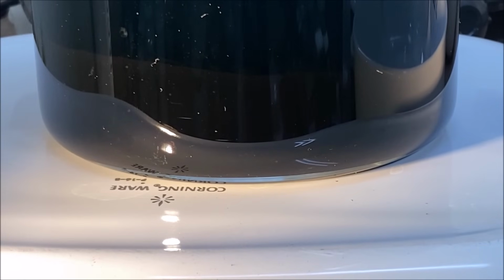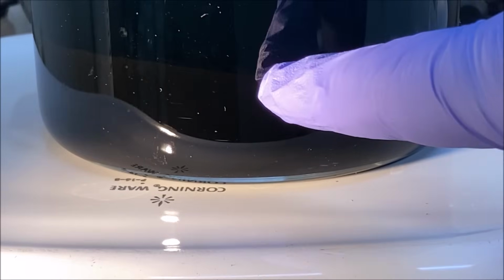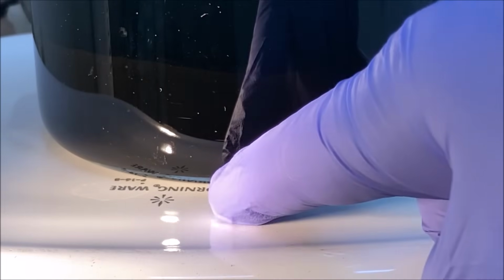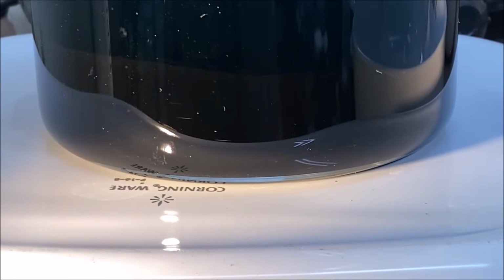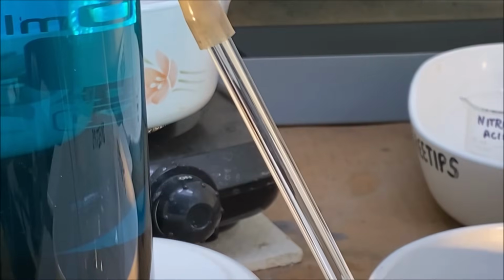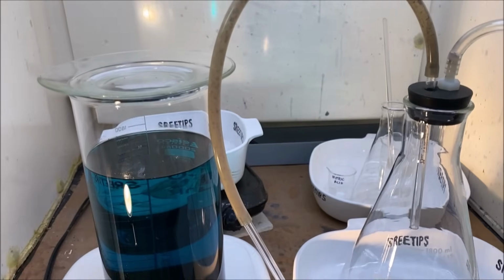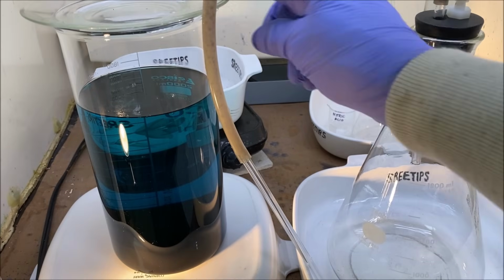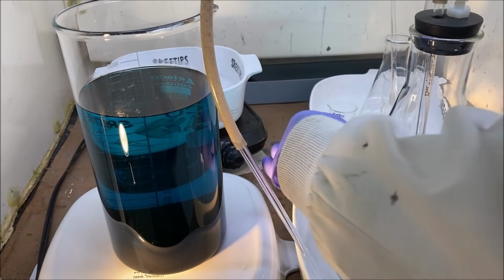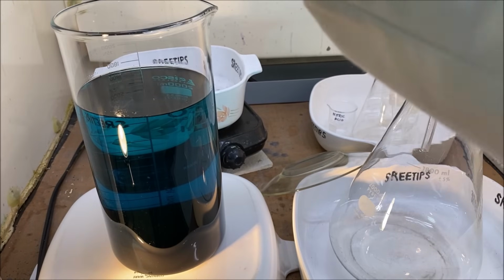Here's our solution. It's been allowed to settle for about 2 days. There's a level right here, and there's some solids that have accumulated on the bottom of the beaker. And I've got this blue liquid on top of it. And I'm not sure what that solid material is down there. So what we'll do, I'm going to use our vacuum bottle.